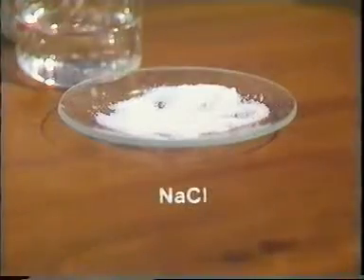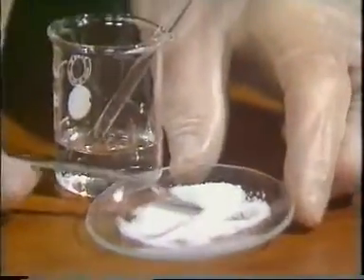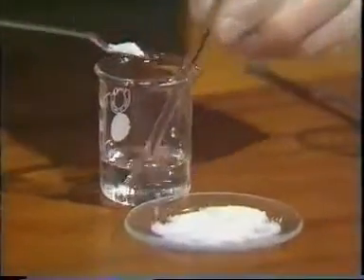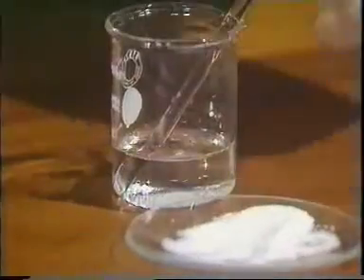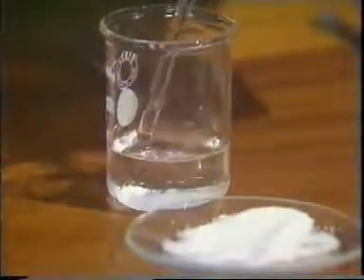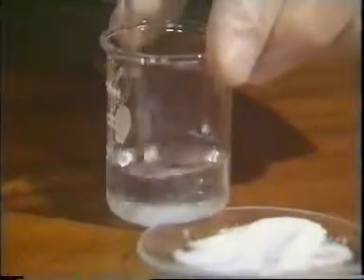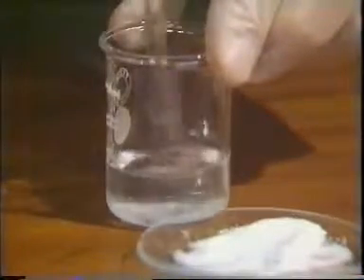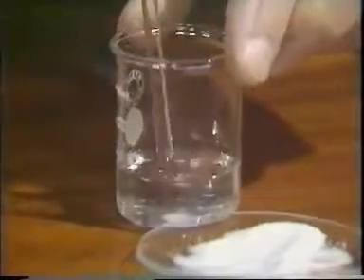First, sodium chloride. As you can see, this is a white solid. Now if I put some in the water and stir, nothing very much seems to be happening. No sign of a reaction. The solid appears to be dissolving quietly.